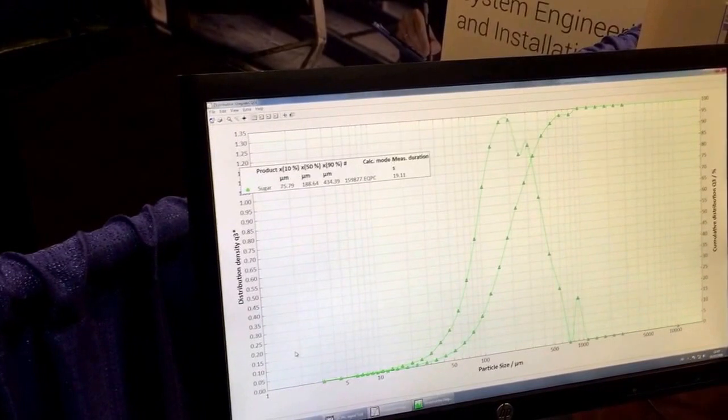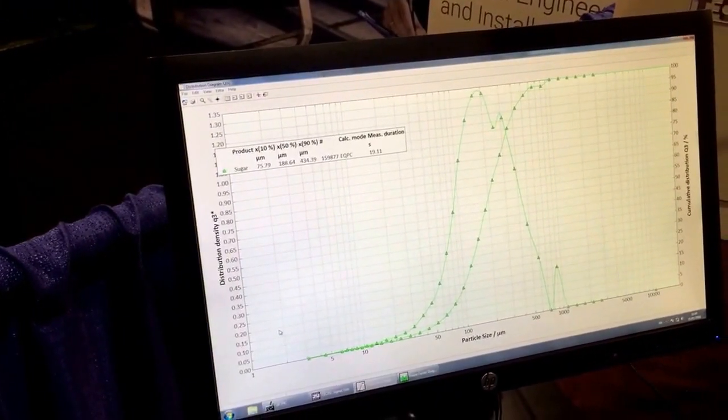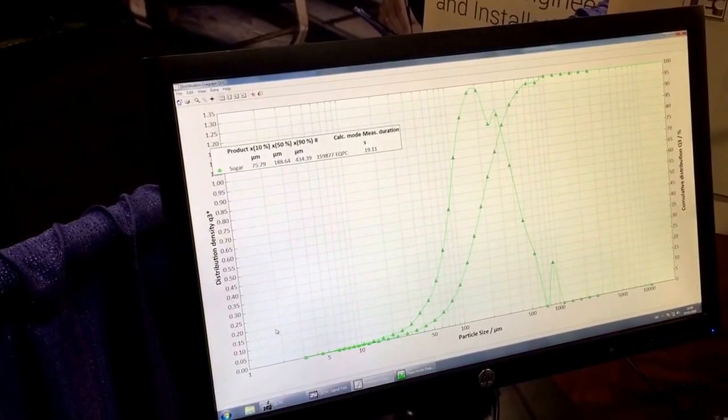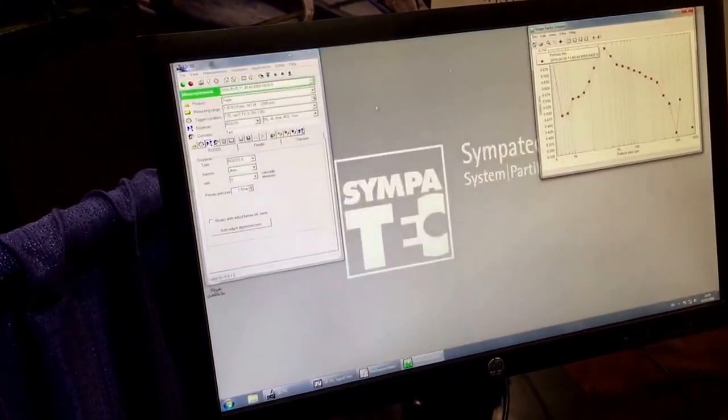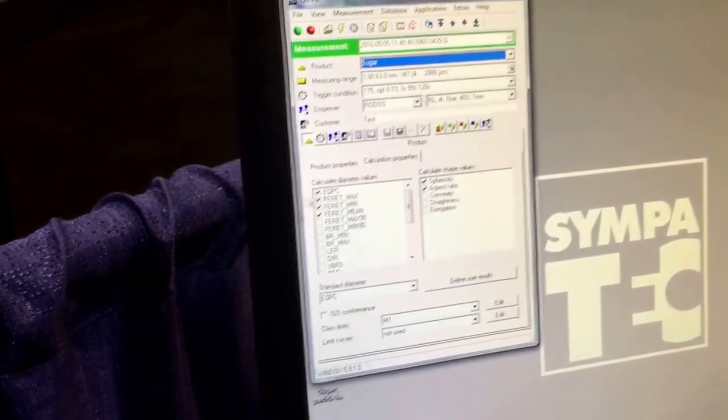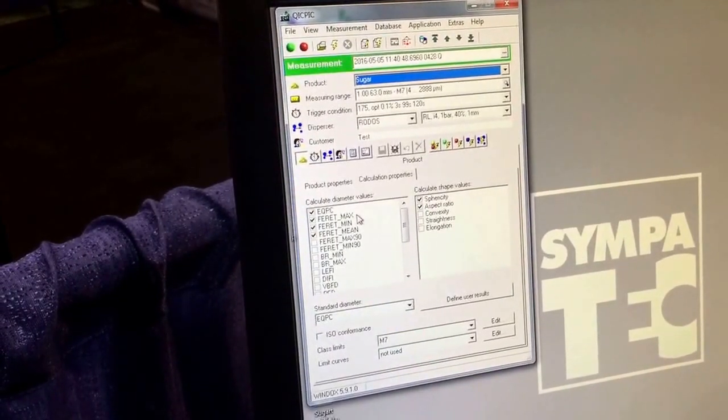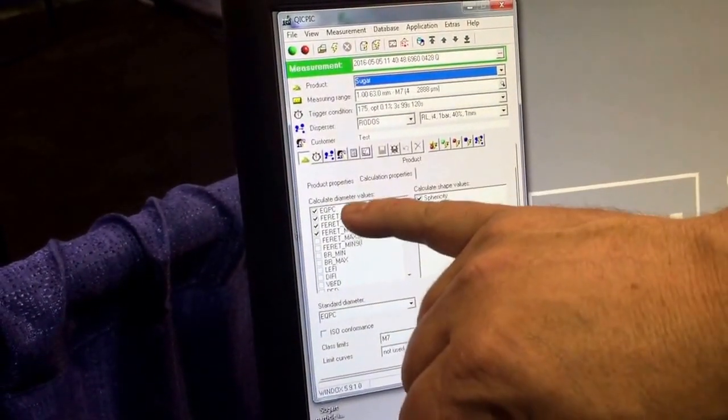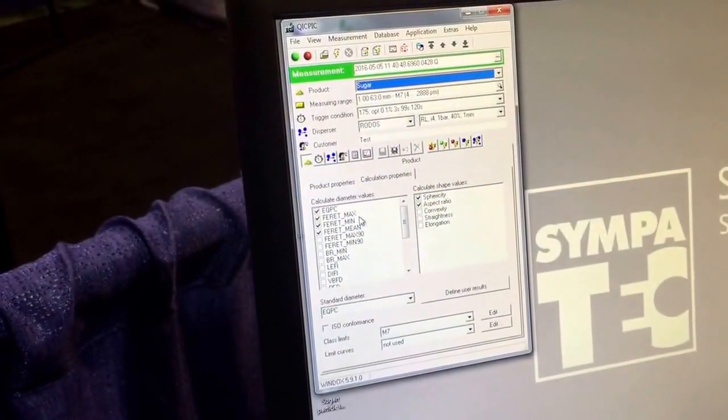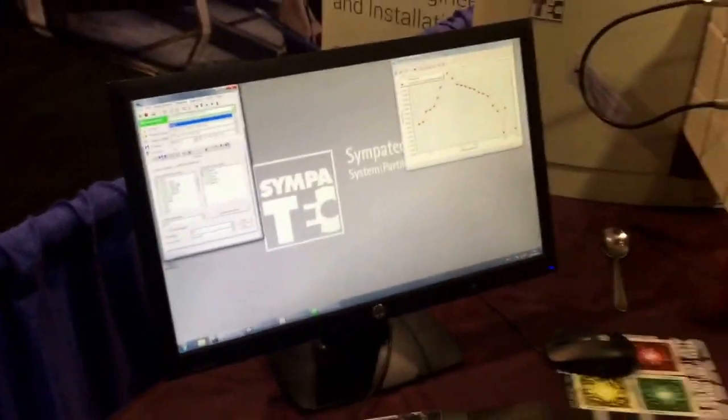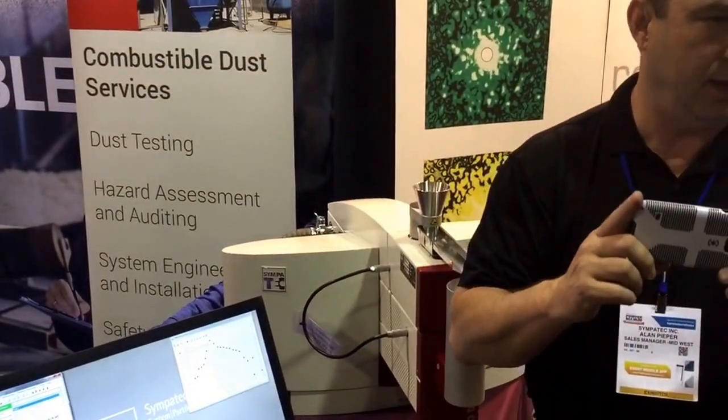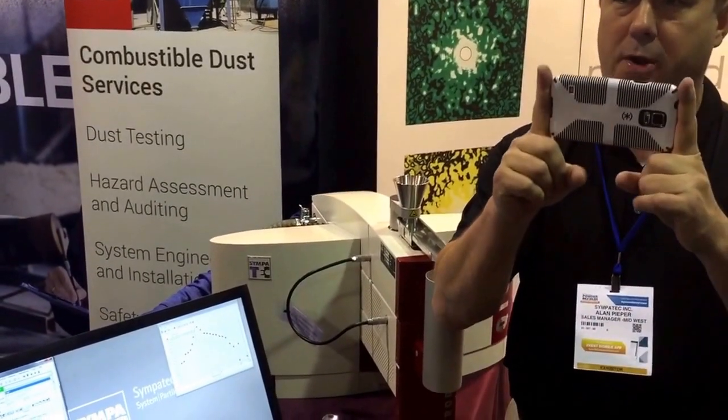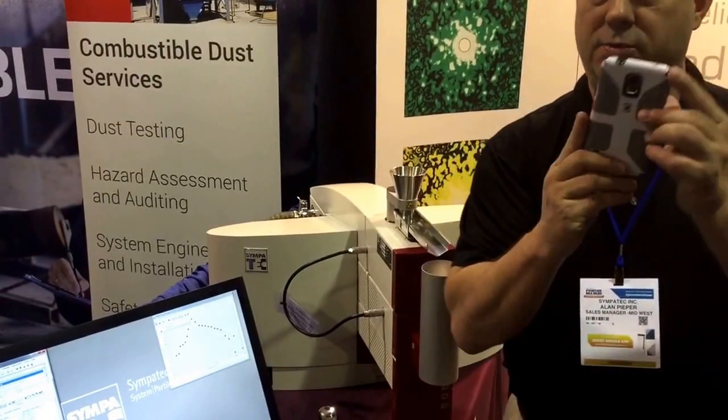In this case, we use something called the calculation mode, called equivalent projecting area of a circle. It says I see the volume here, if it were a sphere or a circle you would have this diameter. But one of the nice things about imaging is I can go back and choose other diameter values. For example, the maximum diameters. So if it's this guy, what the system does, it draws two parallel lines every degree, 180 times around every particle.